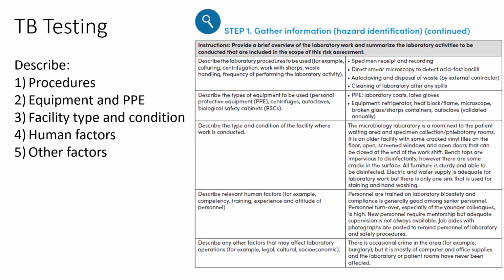Bench tops are impervious to disinfectants, but there's cracks. And then other things of note, the important thing is there's only one sink, and it's used for staining of the slides and hand washing. So this is a shared sink for both purposes.